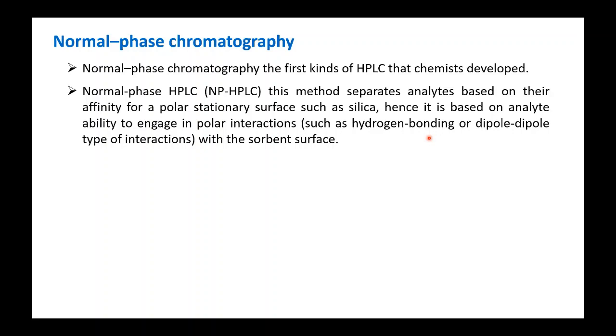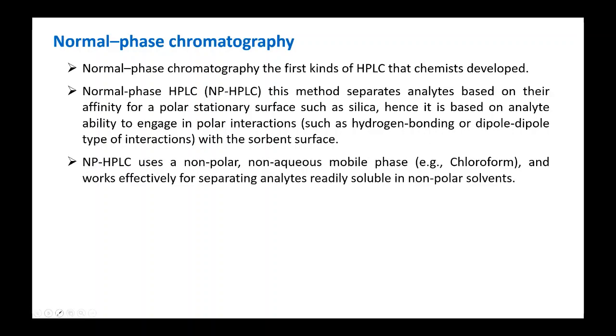Now what we see is that in normal phase HPLC, a non-polar, non-aqueous mobile phase is generally utilized. For example, chloroform.